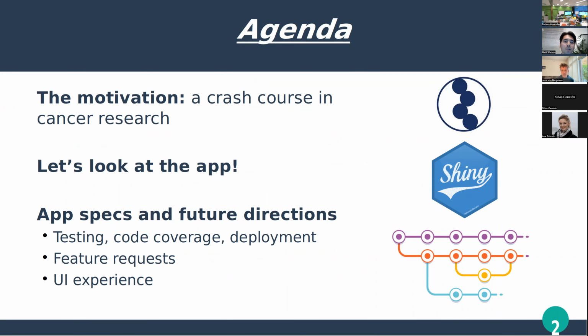The first one is going to be a bit of our motivation. So I'd like to give a couple of minutes, sort of a crash course on some interesting and applicable ideas in cancer research to set the stage for why we think this application might be useful to the research community. Then we're actually going to load up the app.